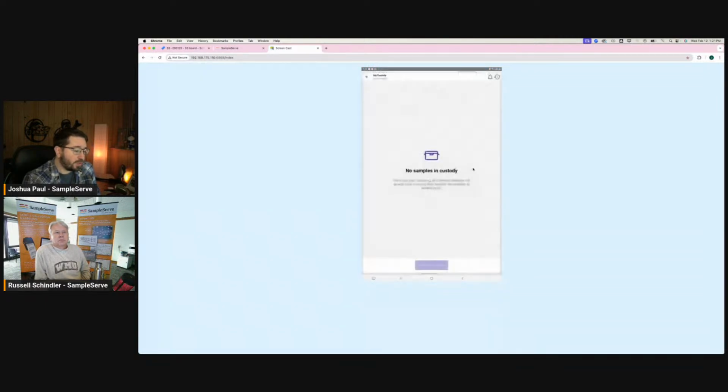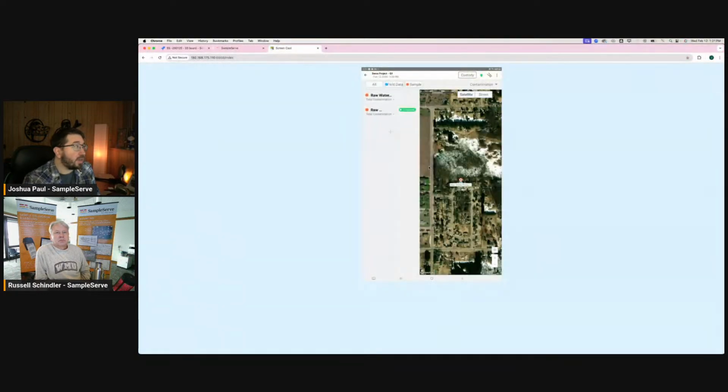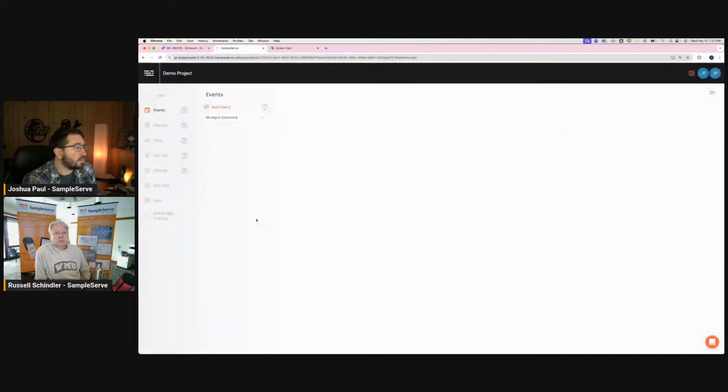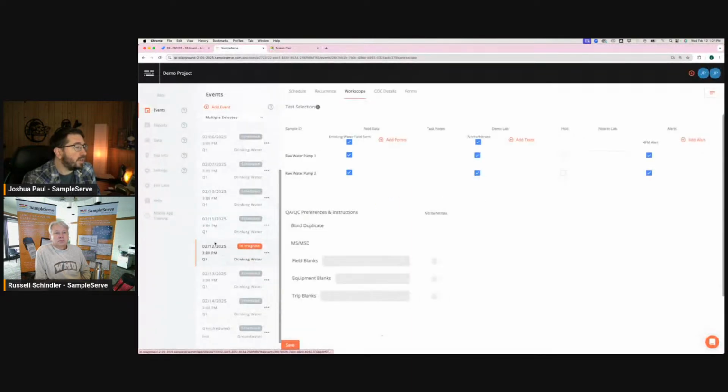I have no more samples in my custody. So I'm going to go back to the main screen. Now let's head back over to the platform here. I'm going to hit refresh. Now you can see this sampling event has a new progress bar. It says in progress. So it shows you that somebody's out in the field. You know, they've taken data.